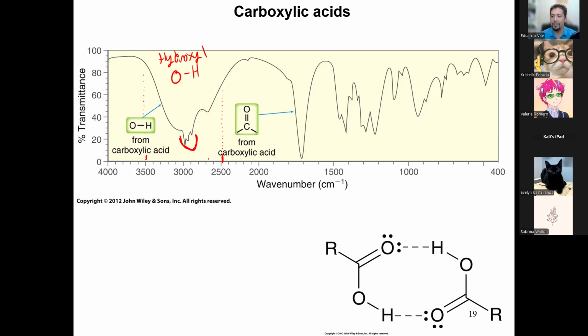CH, that's right. Alkyls, that's right. Those are the stalagmites. They are always present in all spectra. Always. You need to know where they are. The stalagmites are always sp3 CH stretches. Sometimes it's sp2, but most of the time it's just sp3 CH stretches. The OH hydroxyl signal overlaps the stalagmites, so it creates this weird looking, we call it the wizard's beard.